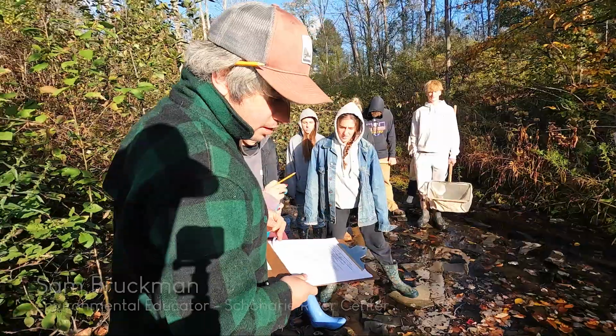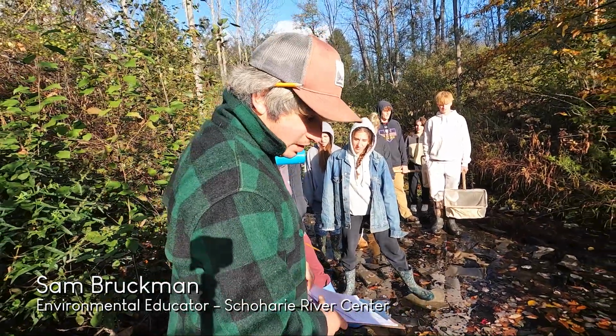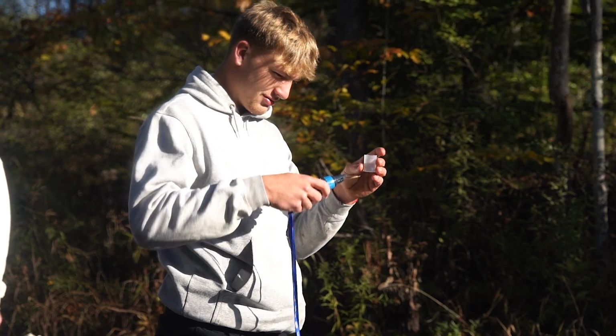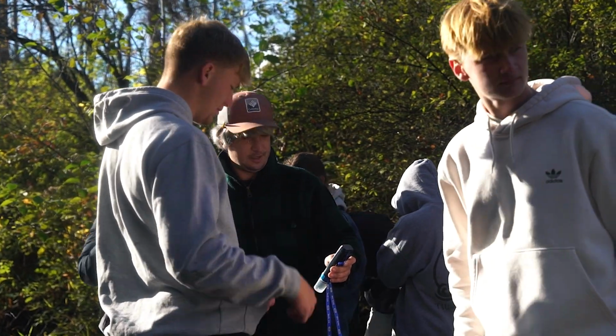We're going to be testing for conductivity, dissolved oxygen, alkalinity. We're going to do a macro invertebrate sample. They're just going to mark it all down. This is in the format that everybody's going to be using all over the state, so it's nice and easy. We also have dissolved oxygen.